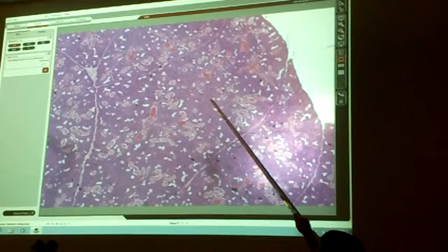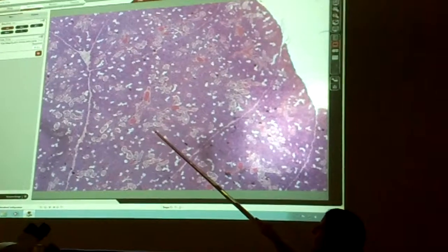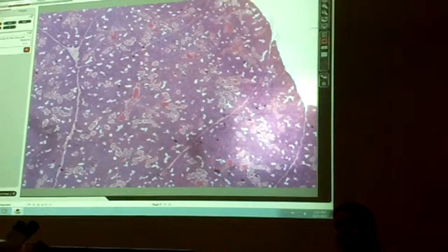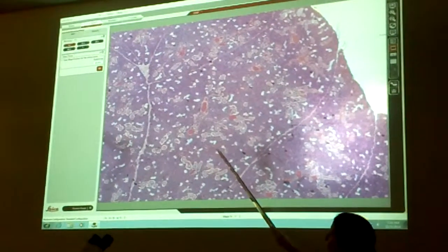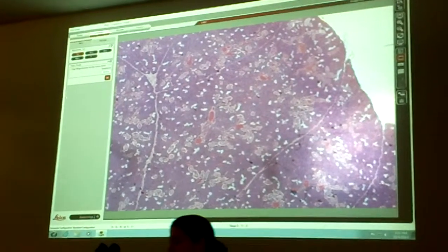And then these here, these blotches. Now here's a caveat about this. I'm trying to avoid saying colors because they're not all stained using the same dye. And so you shouldn't learn it to be, oh, this is the one that's hot pink. That's not a good thing to do. So that's why I'm trying to focus on the majority type of cell is the serous acini. The circles of cells are the salivary ducts. And then the ones that are sparse here, those are the mucus acini. So we'll go up and reject it here.